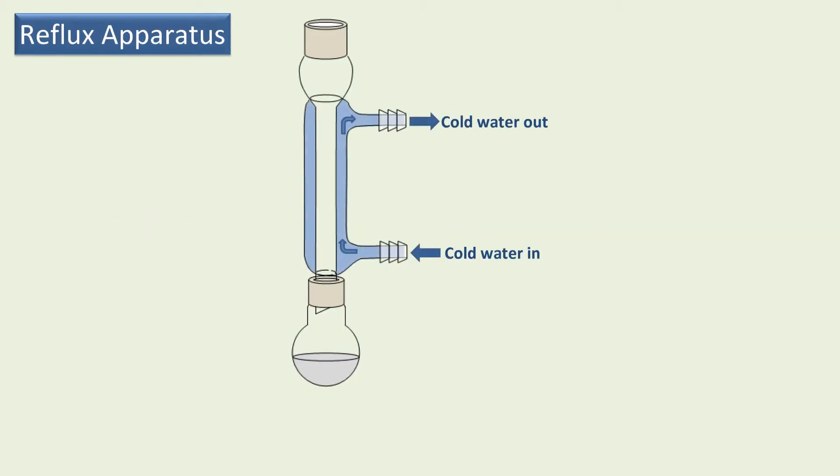We pass cold tap water in through the lower port allowing the outer tube to fill up with the water and then when filled the water flows out of the upper port to the drain.